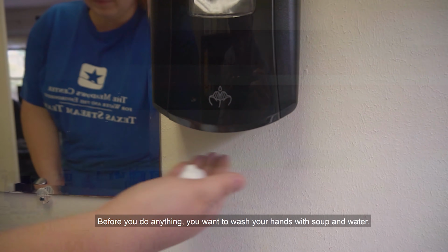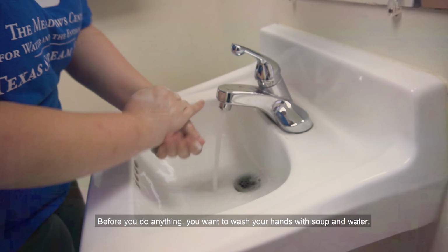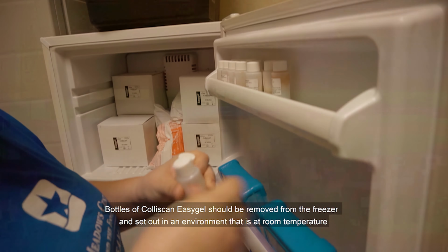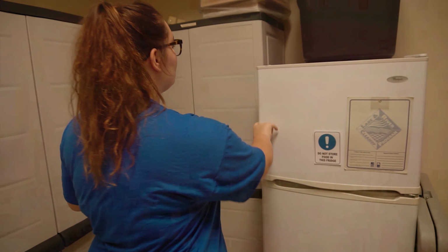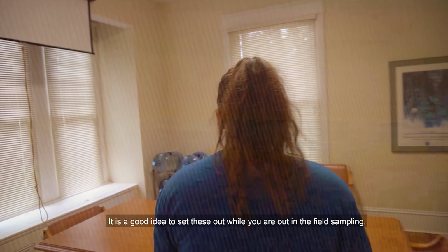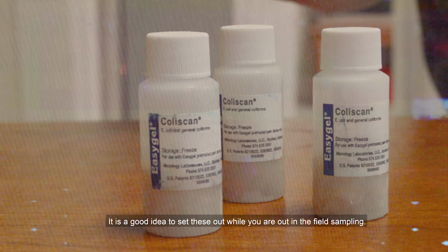Before you do anything, you want to wash your hands with soap and water. Bottles of Coliscan Easy Gel should be removed from the freezer and set out in an environment that is at room temperature to allow the containers to thaw out to a liquid state. This will typically take about 2 to 3 hours. It is a good idea to set these out while you're out in the field sampling.